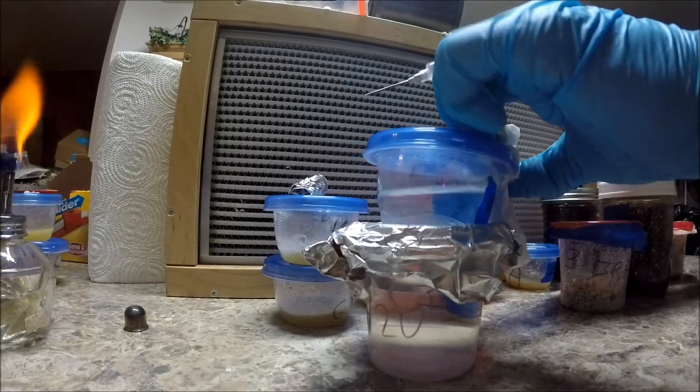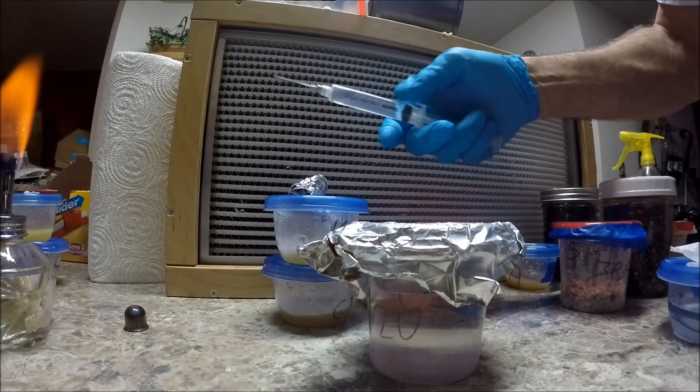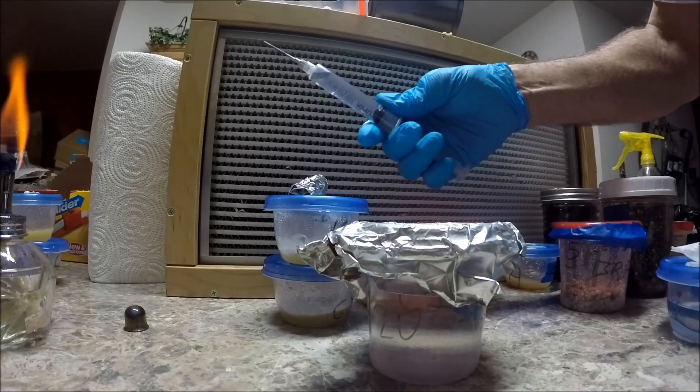I may have gone more through the lid than through the silicone on that, to be honest. So now we have a syringe of sterile water.